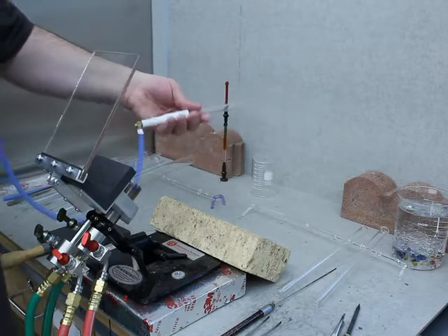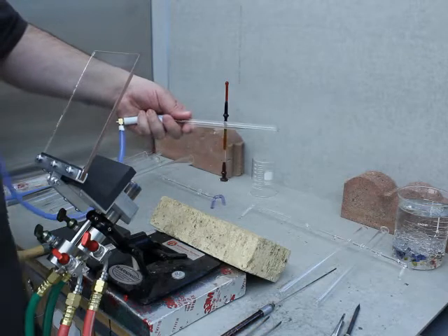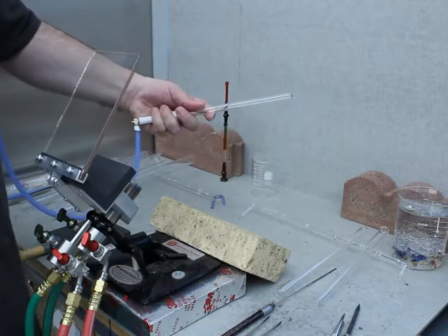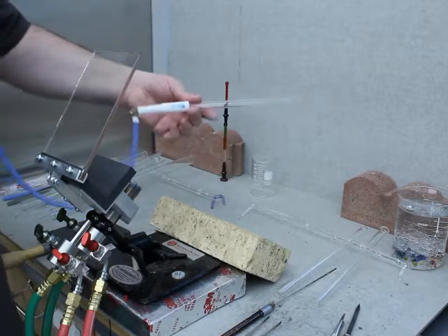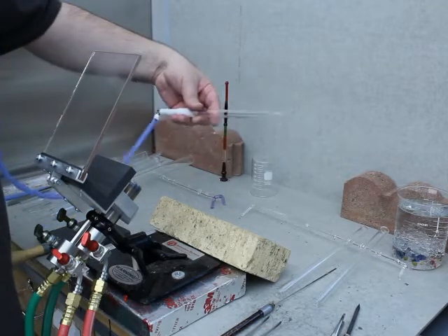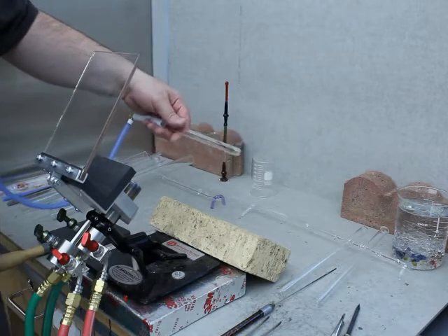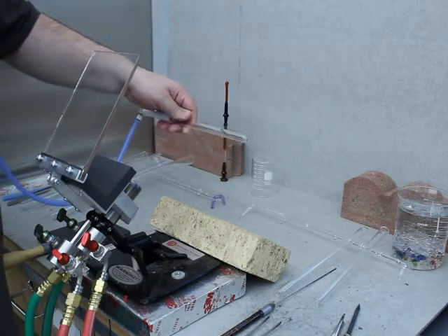The traditional way of pulling a point and blowing through it, that's fantastic. I've tried that. I'm not very good at it, but I can muddle through. But the blow hose is something that, in scientific glassblowing, is absolutely essential.